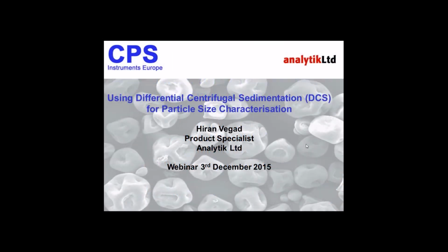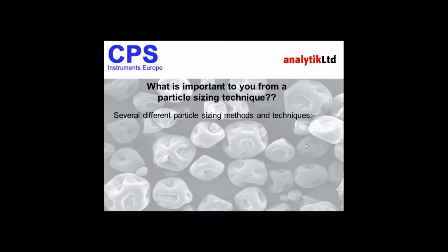Okay, so let's get started with our very first slide. What I've got here is a very important question, which is what is important to you from a particle sizing technique? I'm sure you all will have your own ideas about this and can easily put together a wish list. The question is, which sizing technique is going to work the best for your listed needs?